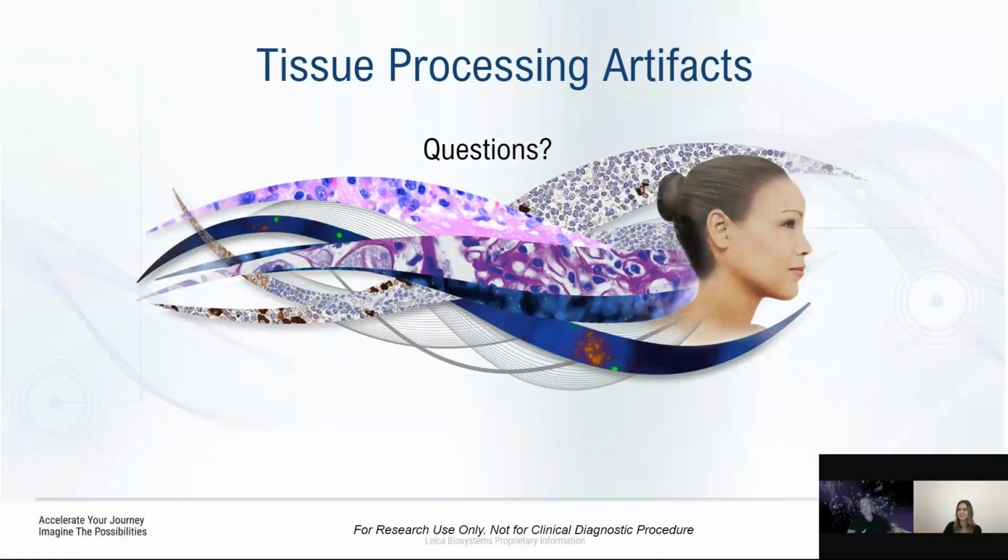I just know what it can do on the front end when it comes to creating more work on the maintenance side. So if you have specimens that you can rinse off and then prep and then put in formalin, it's probably ideal, unless you're looking at specimens where you're looking at clots.